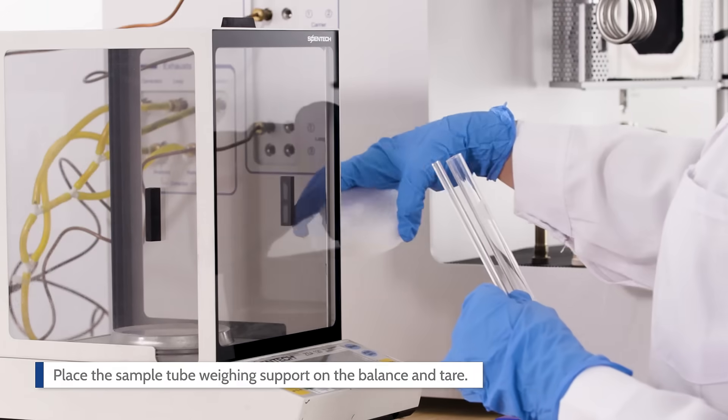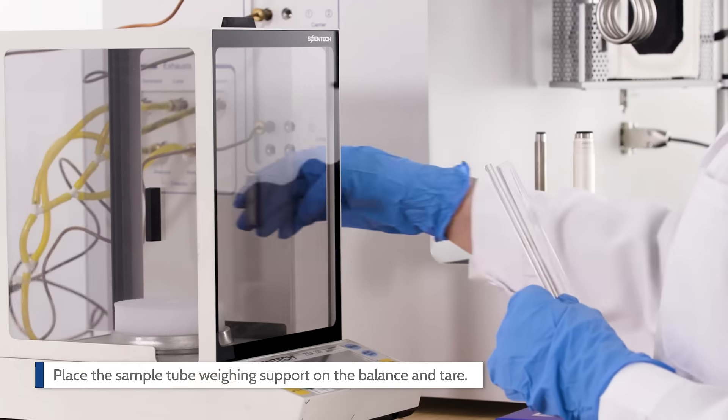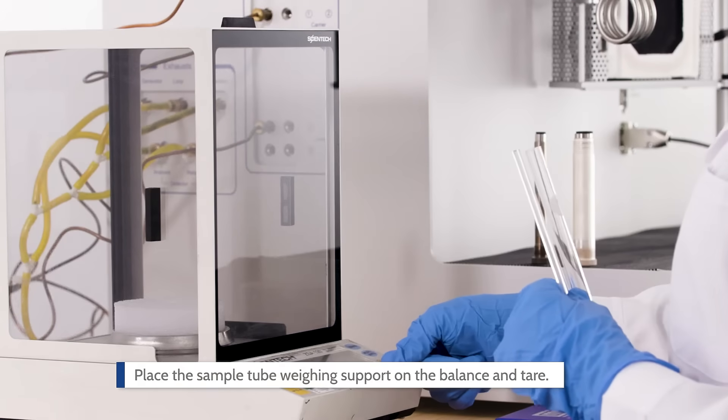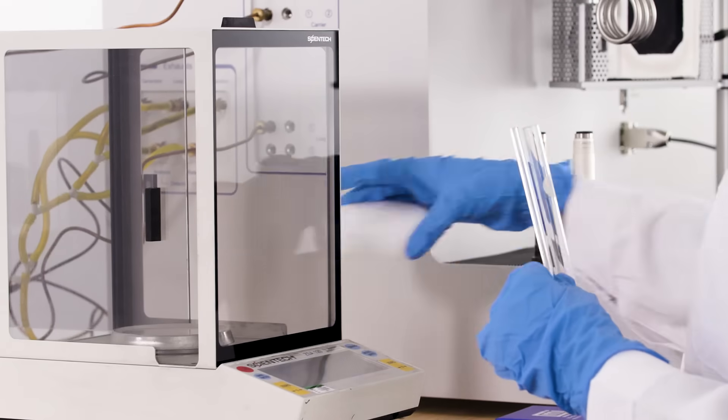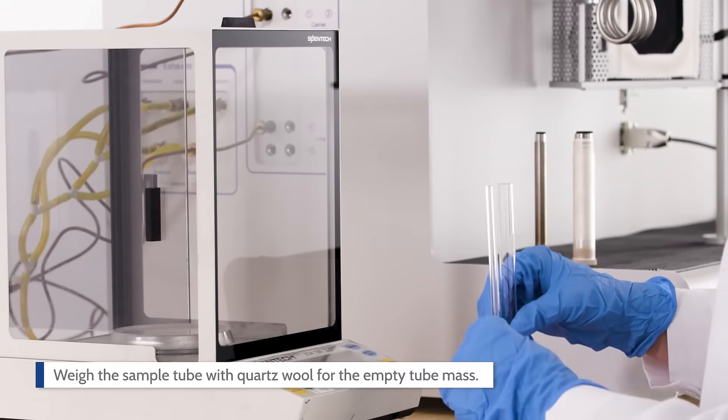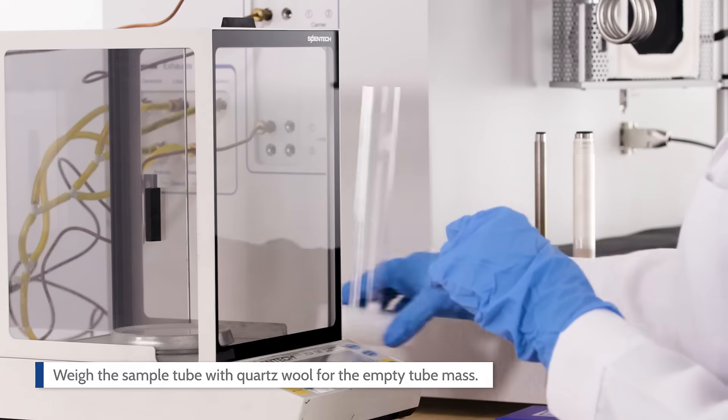Place the sample tube weighing support on the balance and tare. Weigh the sample tube with quartz wool for the empty tube mass and record.